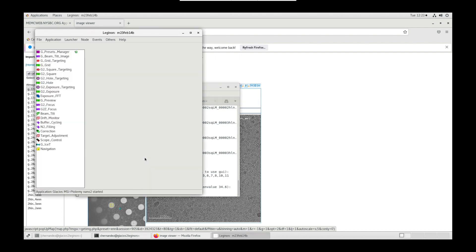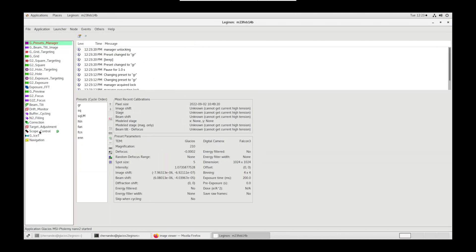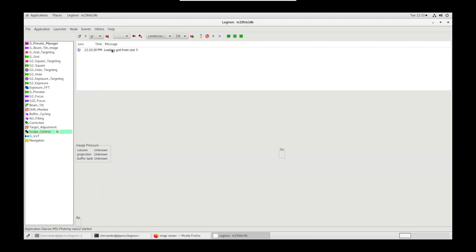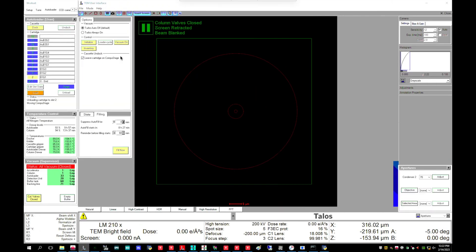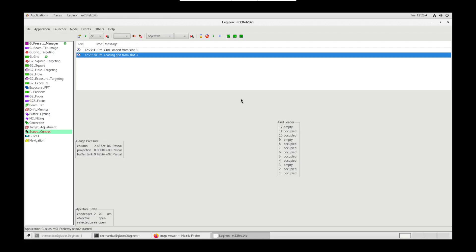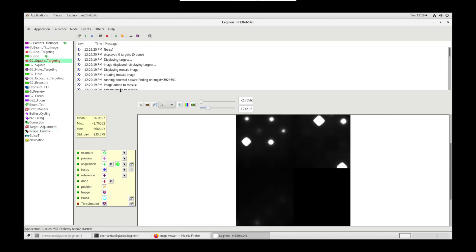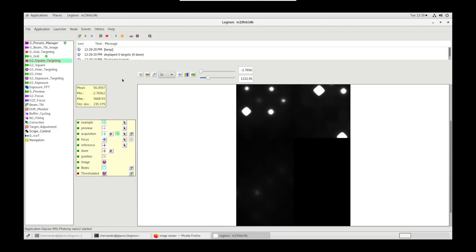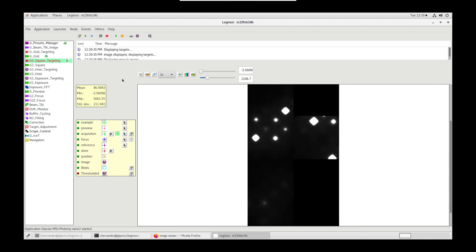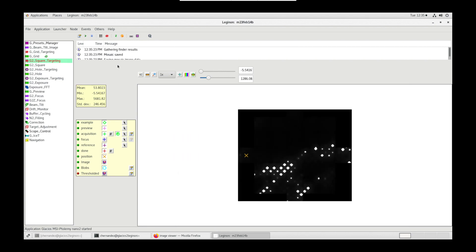SmartLegendon will automatically open and scope control will begin to change grid slides. We'll automatically close column valves, remove objective aperture, and reset the stage between grid changes. SmartLegendon will use our template session settings to automatically screen the selected grid. These settings may be updated as the user observes the session. Those changes will be saved for future grids in queue. The user may observe the session on Legendon PC or Image Viewer. At this point, the operator may tackle other tasks and allow the session to run to completion.